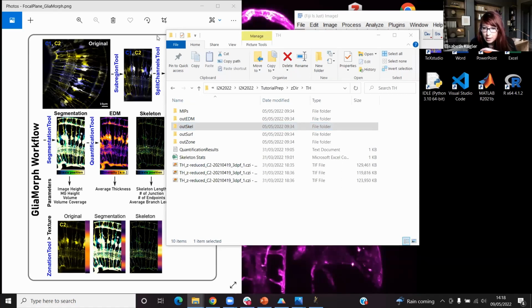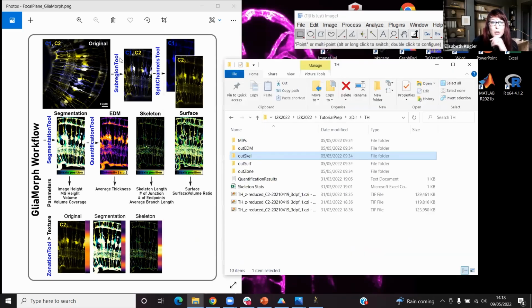Thanks, Jennifer, for the question. She just said, out of curiosity, why do you perform the 90-degree rotation tool? In this case, you could use this in between the sub-region tool, because sometimes when you acquire very long data, which are not very rectangular, you just need to rotate your image first before you can do the sub-region tool. I can link to the bioRxiv manuscript again, and there it describes in more detail when you would use that. But in, I would say, 90% of cases, you would not need the 90-degree rotation tool, but you can use it obviously if you just want to rotate your images.